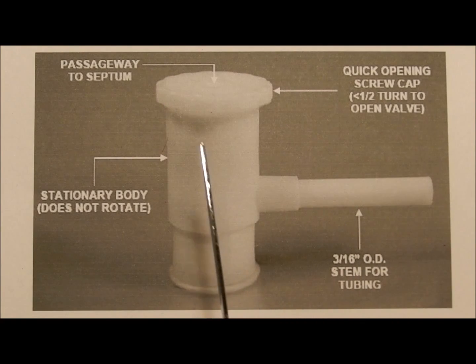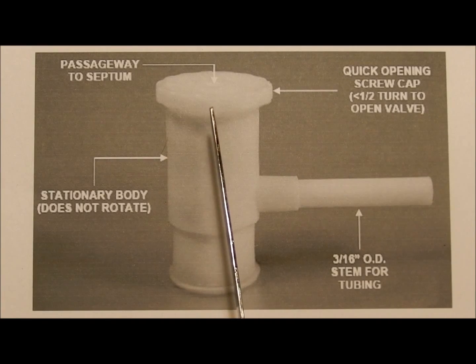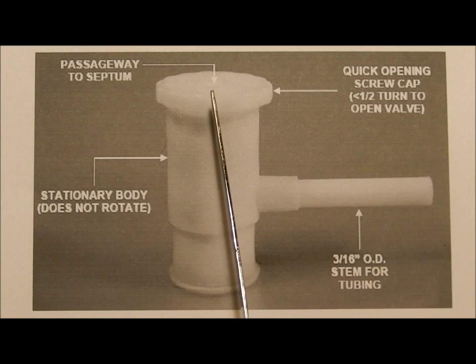The valve is opened and closed using the screw cap by turning it either counterclockwise or clockwise respectively. In the center of this cap there is an opening with a septum that accommodates a needle for taking samples via syringe.